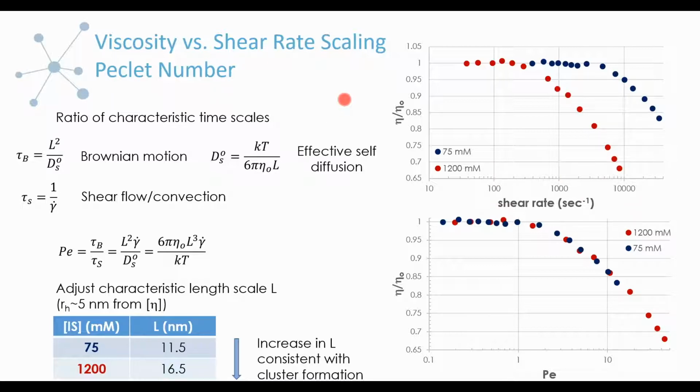So if you think of, particularly in the colloidal systems, why do you have the onset of shear thinning? If you remember from the very beginning when we tried to define the colloidal range, we made it clear that you have an upper limit on size because you still want to consider systems that have Brownian motion. So these molecules are going to be bouncing around in solution, and this is going to provide basically a resistance to the flow.